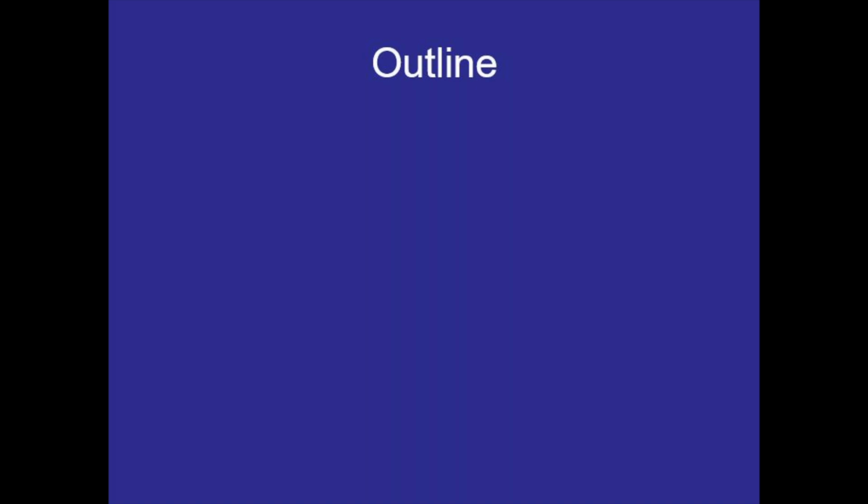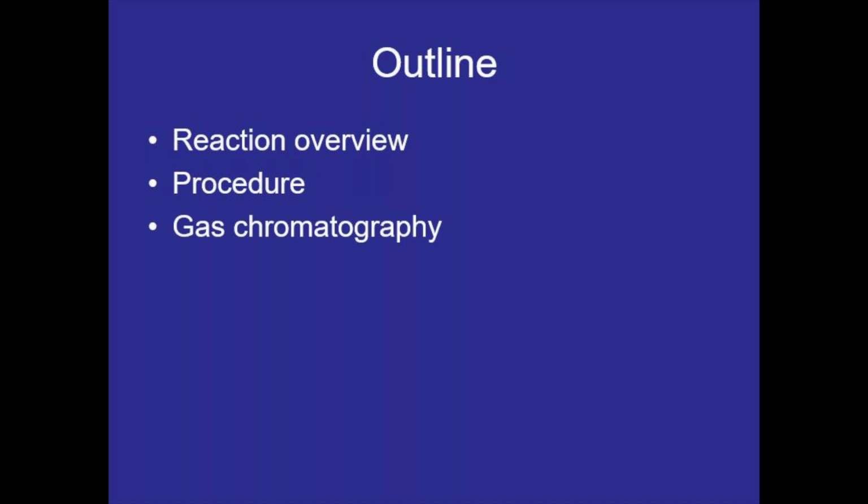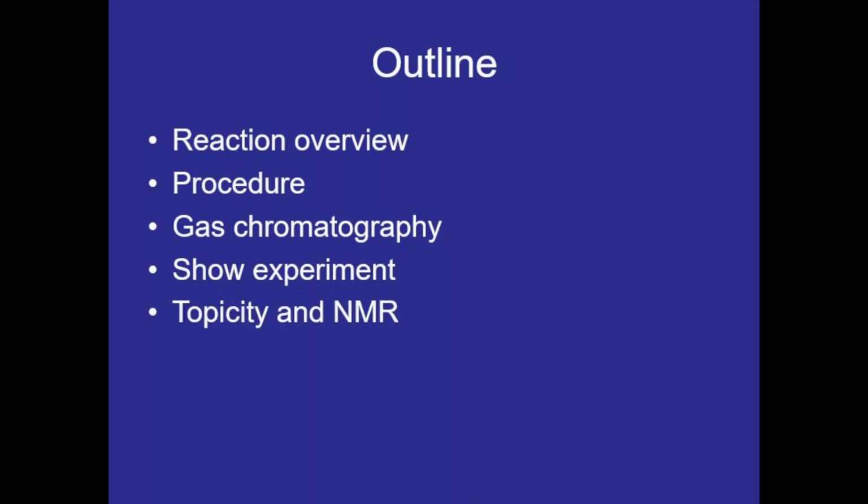Hey everybody, welcome to the reduction of a ketone lab. Here's the outline for this video. I'll be going over the reaction and the mechanism briefly. Then I'll go through the procedure, talking about gas chromatography as well. Then I'll show the experiment in the lab. And at the end, I'll spend a good amount of time talking about topicity and how that applies to NMR.